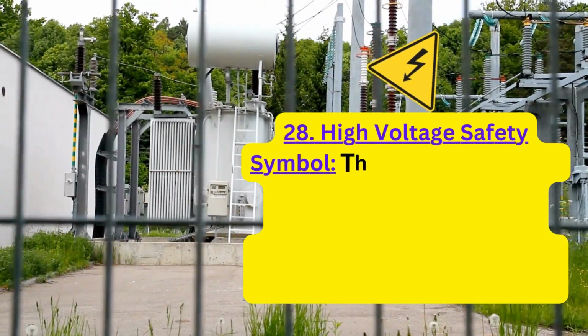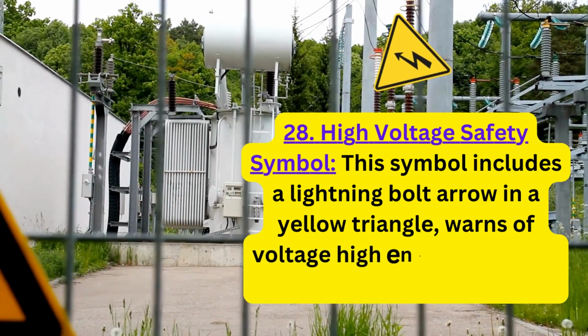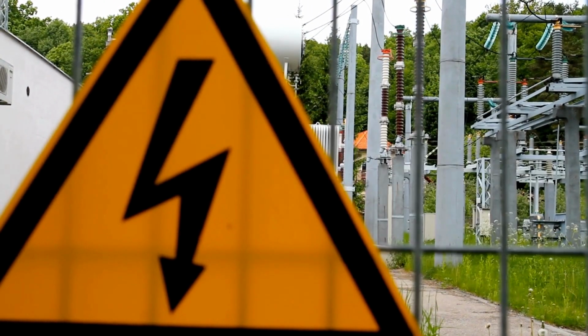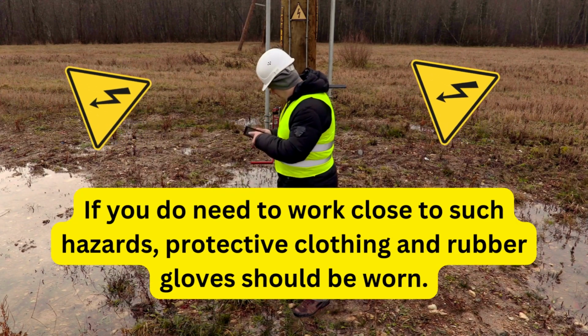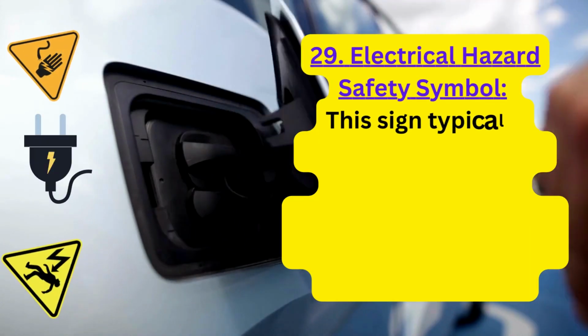28. High voltage safety symbol. This symbol includes a lightning bolt arrow and a yellow triangle, and warns of voltage high enough to cause serious injury or even death. If you do need to work close to such hazards, protective clothing and rubber gloves should be worn.